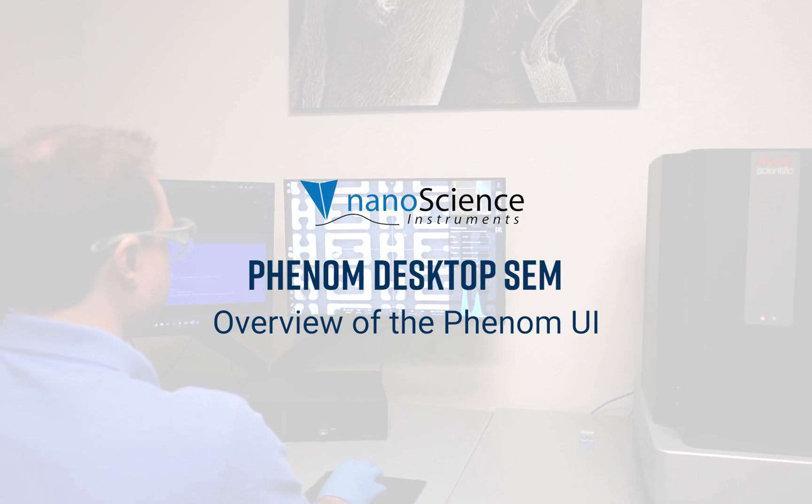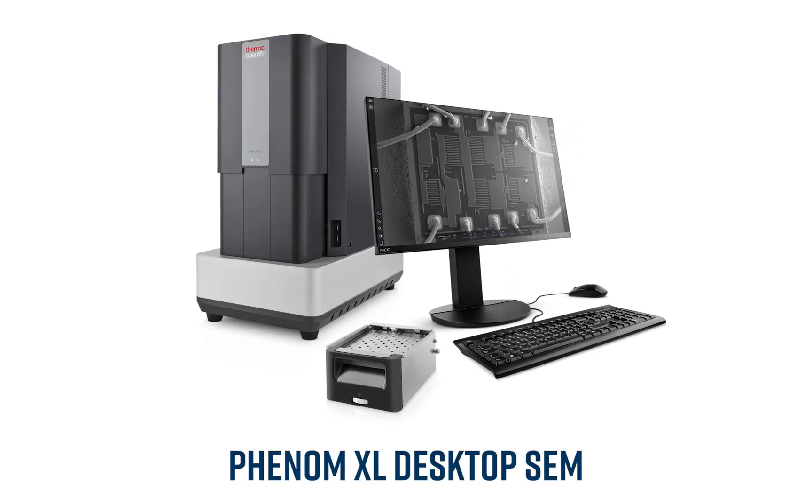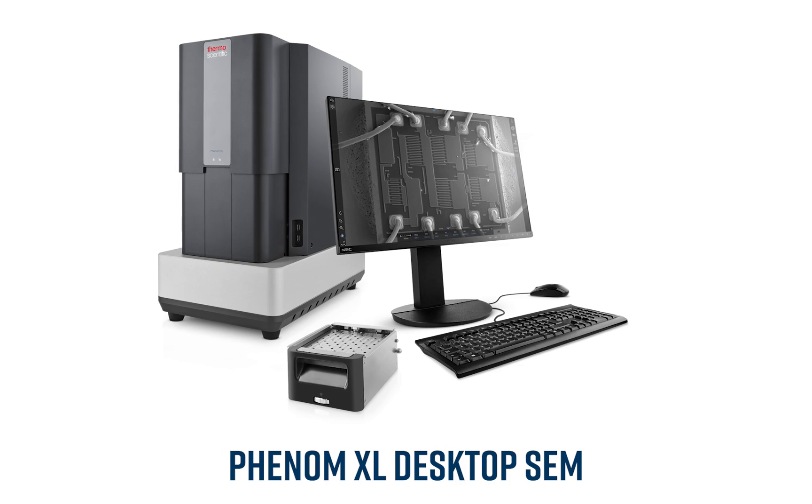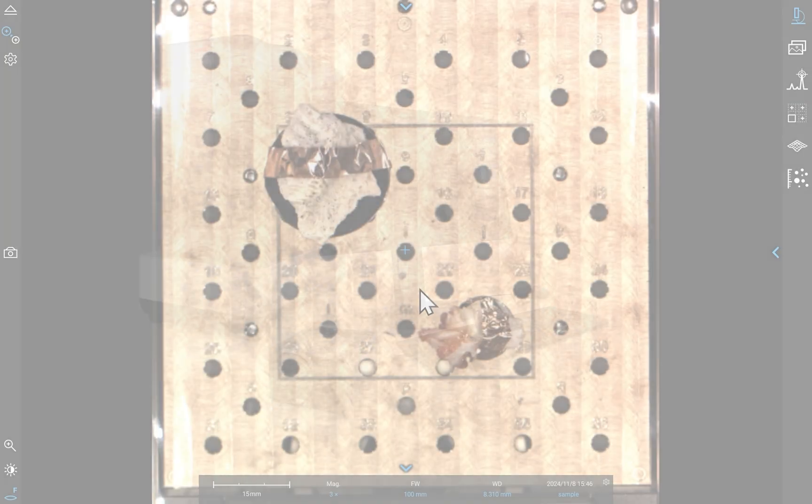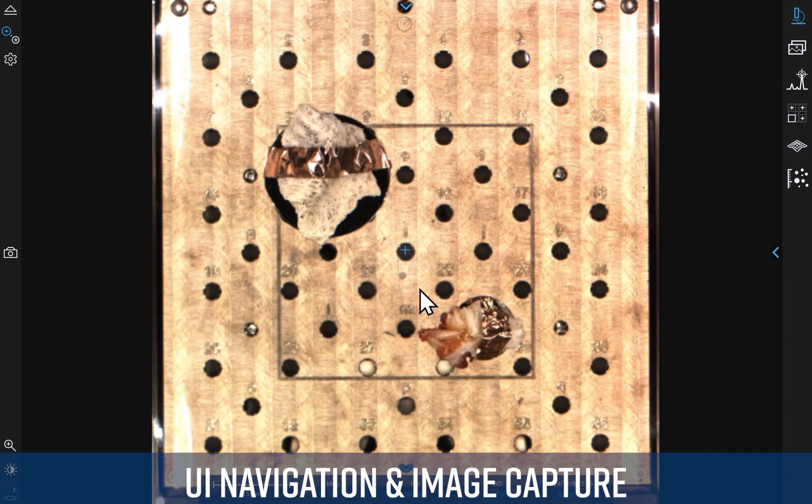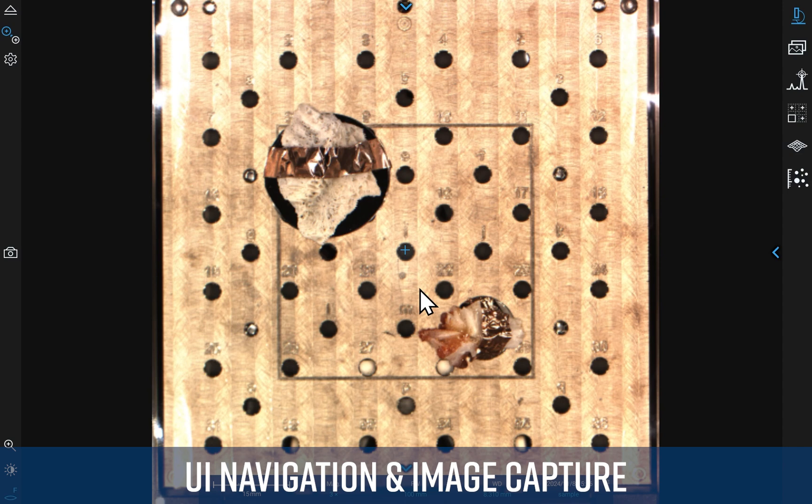In this video, we'll give you a quick overview of the Phenom XL Desktop Scanning Electron Microscope User Interface. We'll walk through the basics of how to navigate to a specimen and acquire an image.